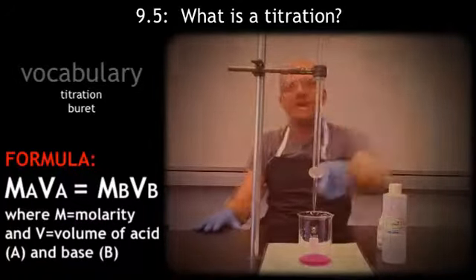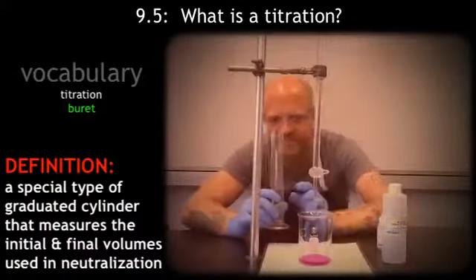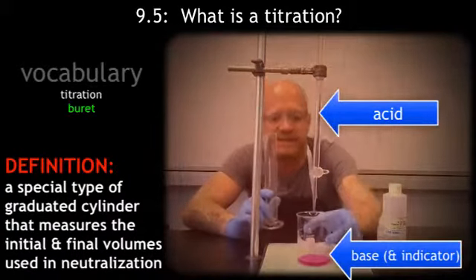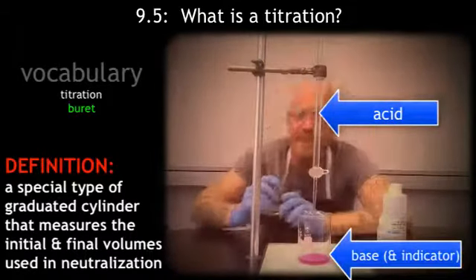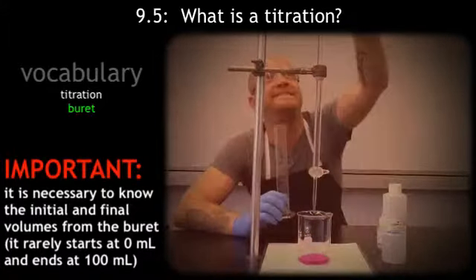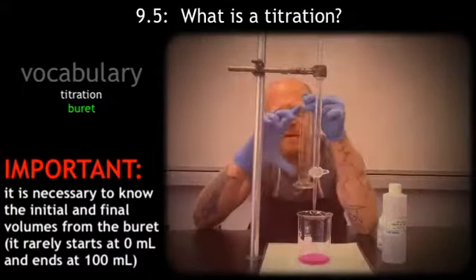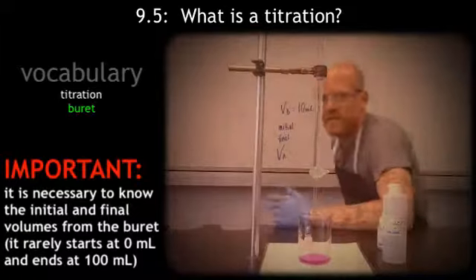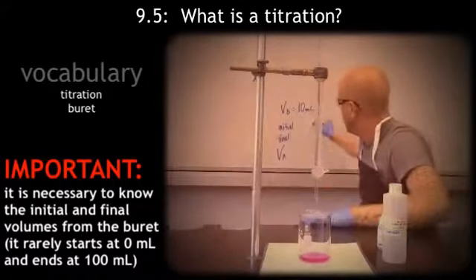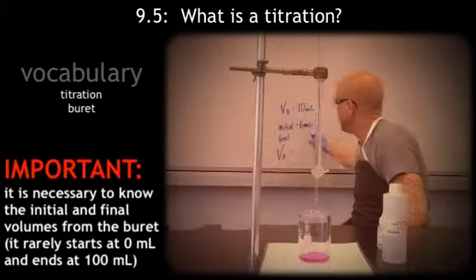First thing we've got to do is, you can't see up here, but a burette, which is what this is, is very similar to a graduated cylinder. So I'm moving the acid that is in here, because this is the base, the sodium hydroxide, that turned pink. I am moving the acid through my burette. And what you notice is it might not always be perfect. Sometimes I might start at a certain volume and end at a certain volume, but it might not be 0 and 100. So what I have to do right now is look at my volume of my acid. I'm starting off at 6 milliliters.